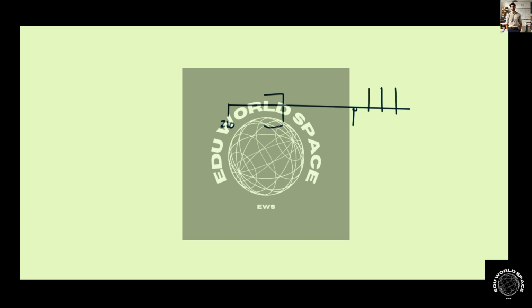But we don't see anything from around, say, 160 onward. And 160 onward is where we typically see carbonyl signals, right? However, ketone signals can be beyond 210, right? That is, it's very likely that we have a signal that's off the chart here.